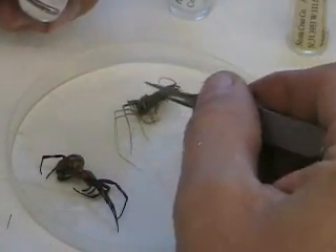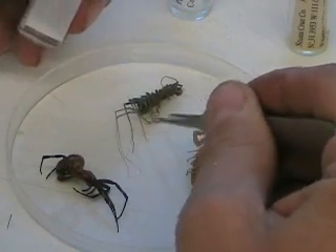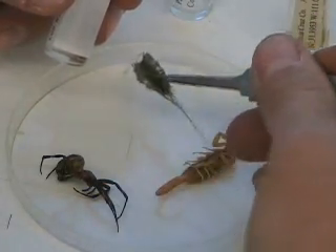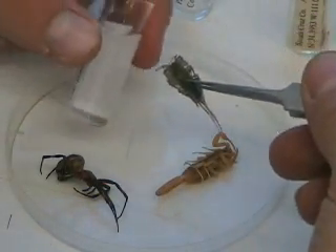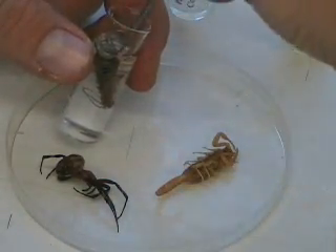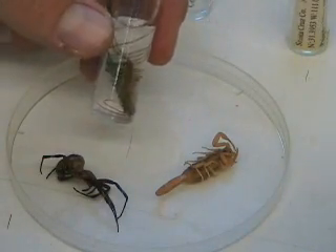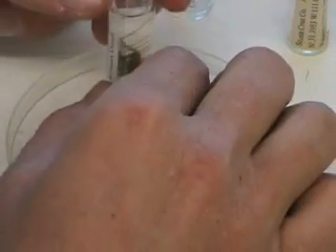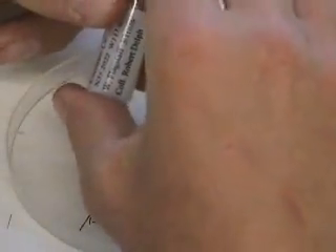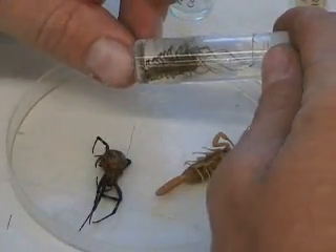The specimens are euthanized the same way as insects, either by freezing or sodium cyanide. I take the specimen — this is a centipede, a house centipede — and I just put it into the vial of alcohol. When you're putting a specimen in a vial, you want to make sure that the specimen is visible, so that the label is also visible on one side, and then you can turn it around and also see the specimen.